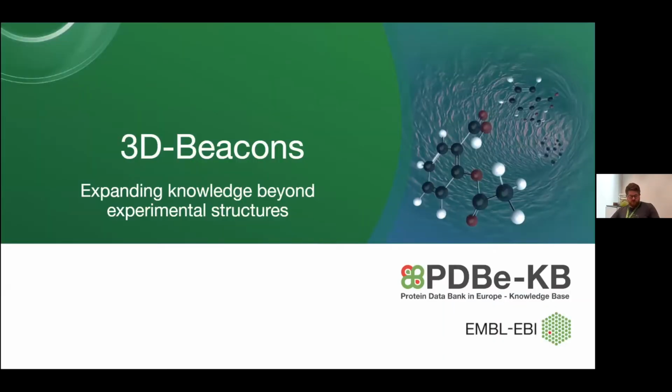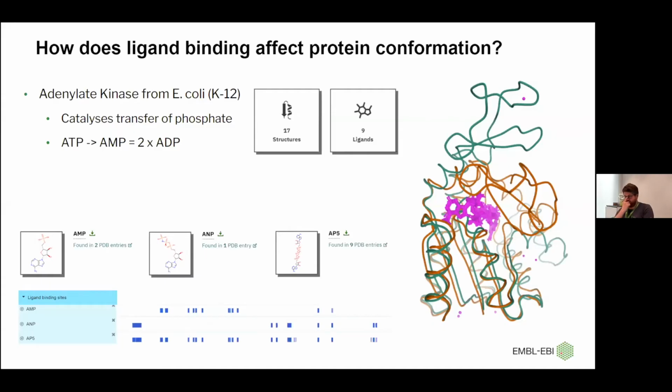So before I finish, sorry, Chris, did you have a? Yeah, there's a question in the Q&A. Is it possible to superimpose the structures of different proteins, such as protein isoforms?